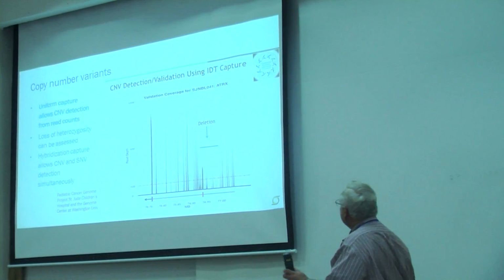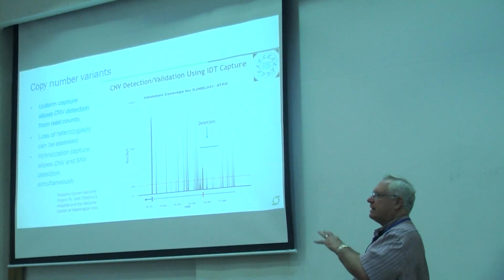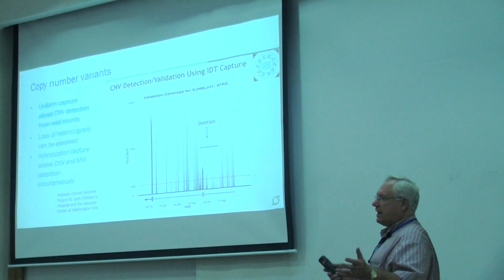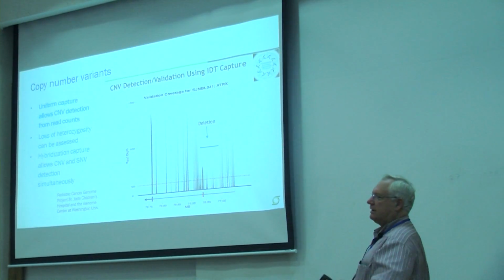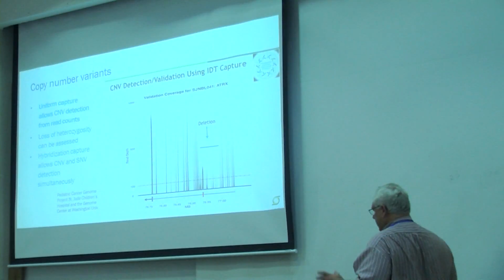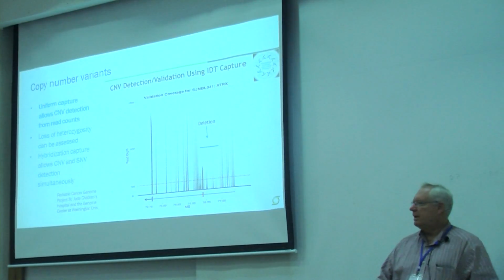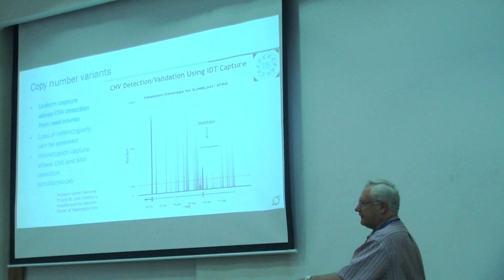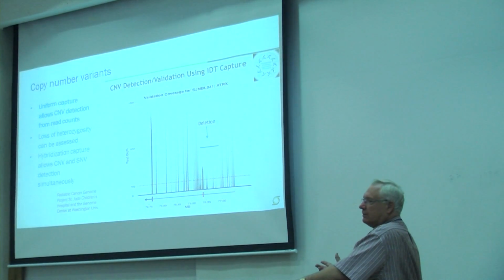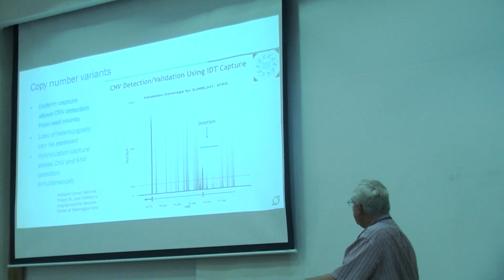The nice thing about that is that you can spike them into sets. So instead of having to make an entirely new probe library, if you want to add content, all you have to do is make the additional probes and then spike them into the old library. I think some of that's enabled by the fact that you get so much mass yield that you've got plenty of material to work with and you can always just spike more into it. And so adding new gene content is fairly inexpensive, and in fact only takes a week. You decide you want 10 more genes to put into this pool, you order the oligos, and a week later you've got them and spike them in, and it's done.